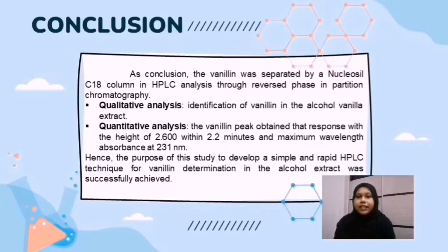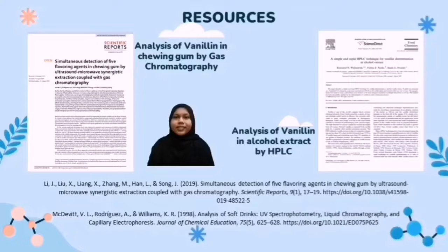Hence, the purpose of this study, to develop a simple and rapid HPLC technique for vanillin determination in ethyl alcohol extract, was successfully achieved. These are the two journals that we referred to in completing this video assignment, along with the list of references.